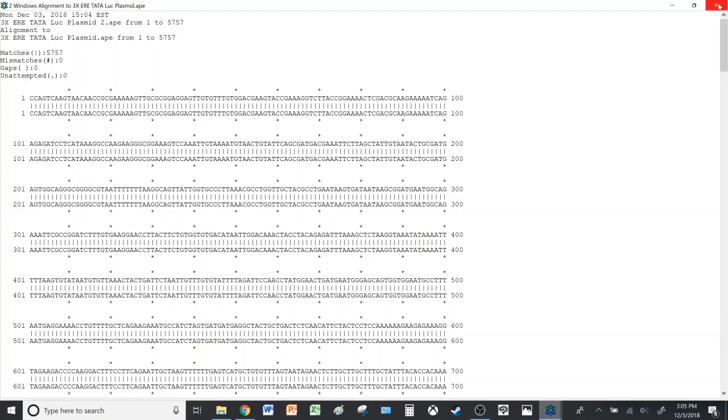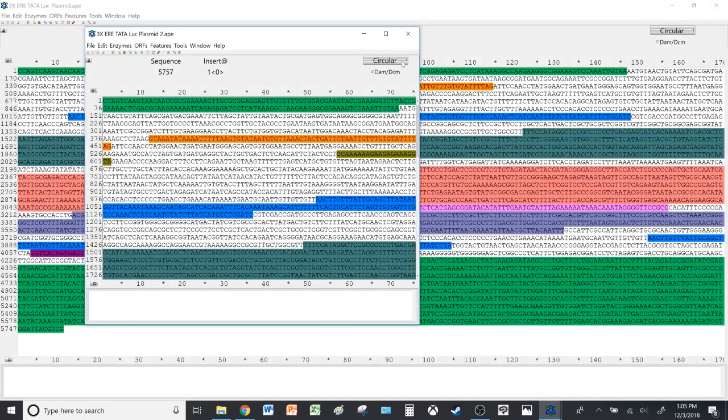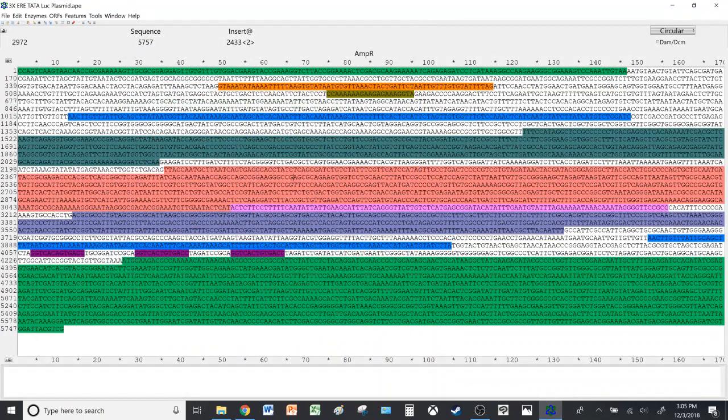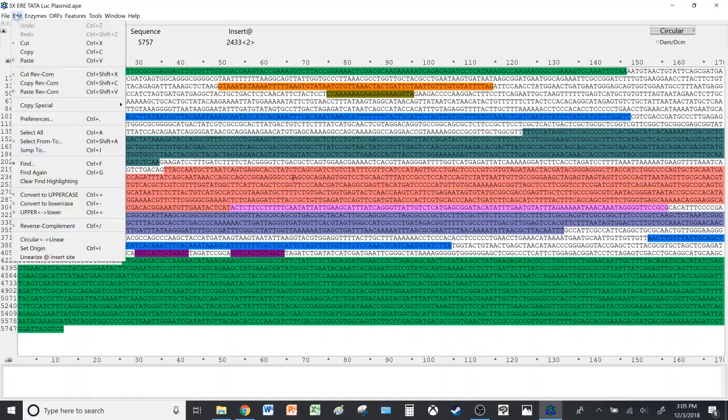We won't need this. We'll close this. And finally, if you wish to present the plasmid sequence on the complementary strand, what you can do is go to Edit and hit Reverse Complement.